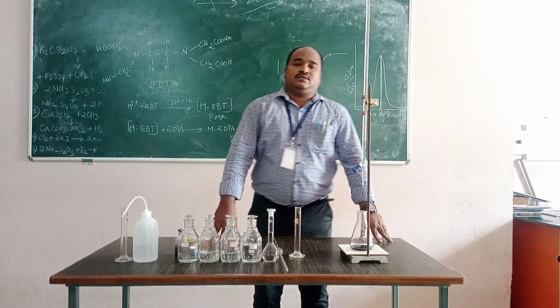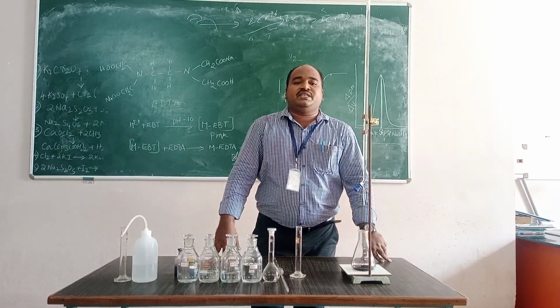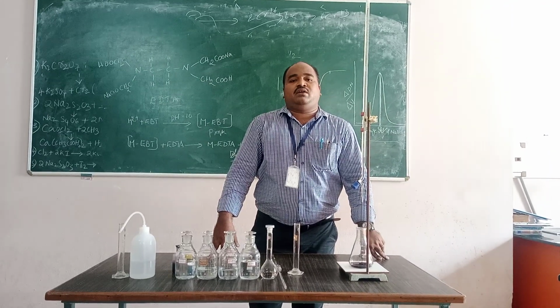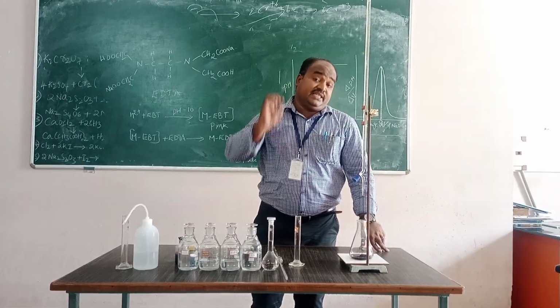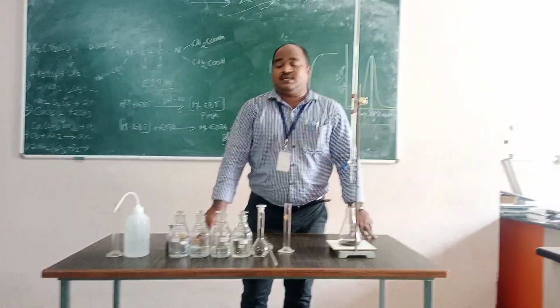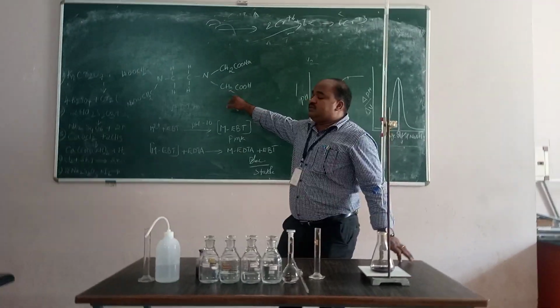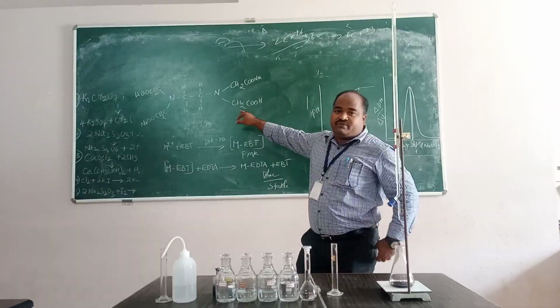Okay students, this is our fifth experiment, estimation of zinc by complexometry using EDTA. Here EDTA is ethylene diamine tetraacetic acid. This is the structure of ethylene diamine tetraacetic acid. Okay, so this is insoluble in water.